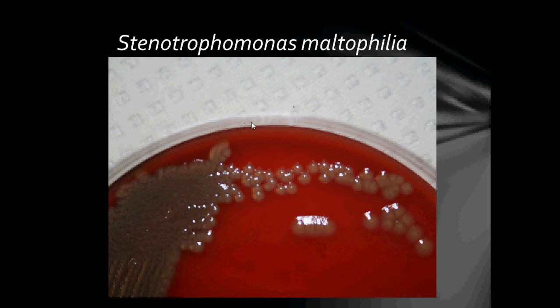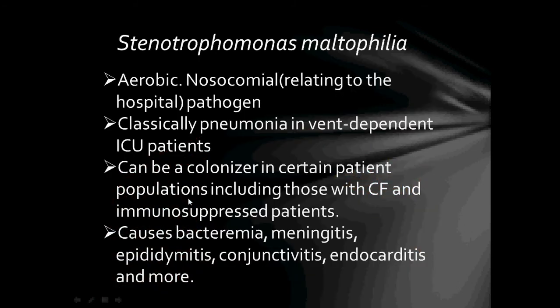Here we have colonies of Stenotrophomonas maltophilia growing on blood agar, and as you can see their colonies appear greyish in colour. Stenotrophomonas maltophilia are aerobic, nosocomial (hospital-acquired) pathogens that classically cause pneumonia in ventilator-dependent ICU patients, and can colonise patients with CF (Cystic Fibrosis) and immunosuppressed patients. Cystic Fibrosis is an autosomal recessive genetic disorder that affects the lungs, pancreas, liver, and intestines.